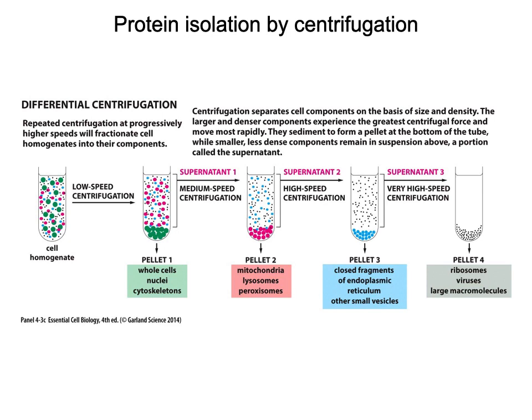Medium speed centrifugation would require a larger centrifuge than that for the most part, unless you have a high capacity one. These ones would be like the size of a microwave, but even in some cases they might be something that's on the floor, maybe about the size of an oven, again depending on how old your centrifuge is. The newer ones are smaller than the old-fashioned ones. With high-speed centrifugation, these are the ones that are definitely going to have warning labels on them to be extremely careful. Things at high rates of speed can harm you if not properly balanced and such. And these ones, again, are usually larger ones that would be standing on the ground, not on the bench top.